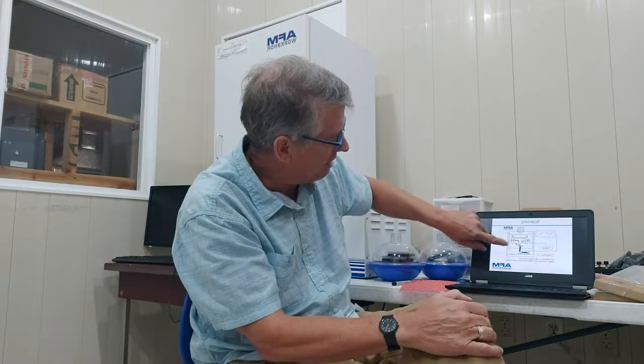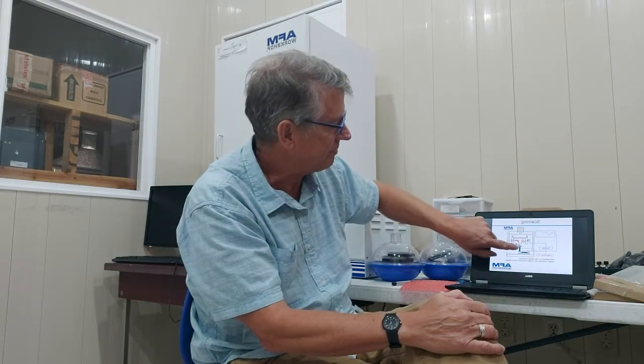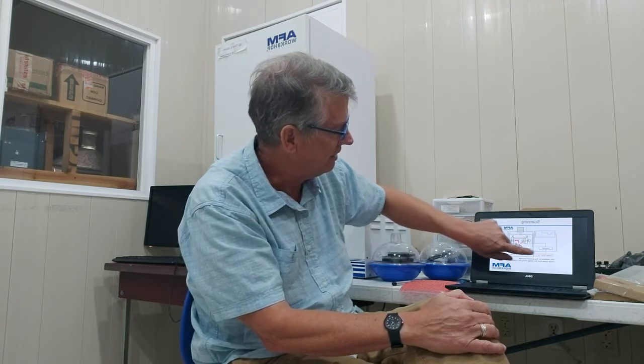And as we scan back and forth, this Z ceramic goes up and down. Okay? So what's going on here is that the voltage on the Z ceramic is the image of the surface. Do you understand that? Yes, I don't know how to explain that, but the movement of the sample with the cantilever is proportional to the voltage. With that, we do need the image of the surface. Right, that's exactly right.